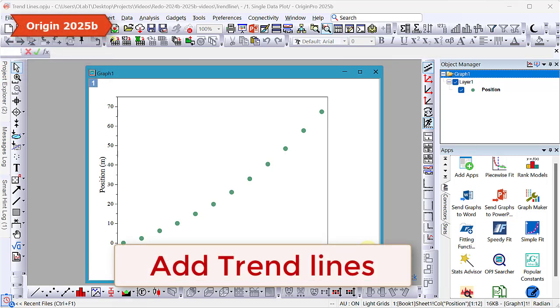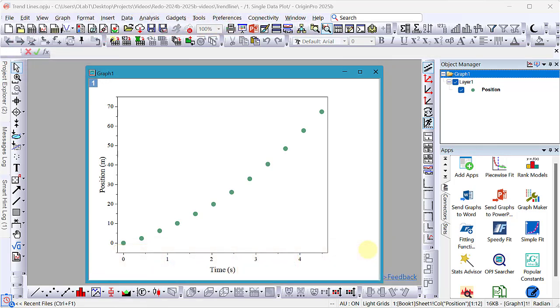In this video, we will see how to add trend lines to data plots in Origin. Let's start with a graph with one data plot.